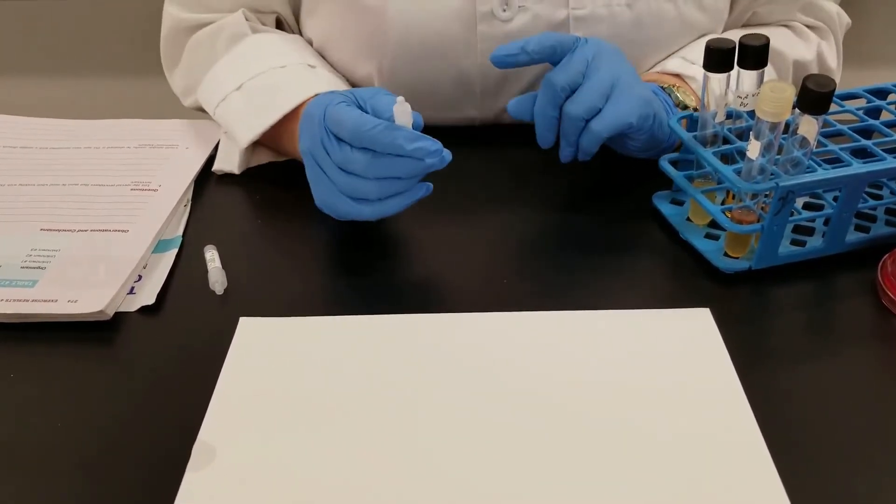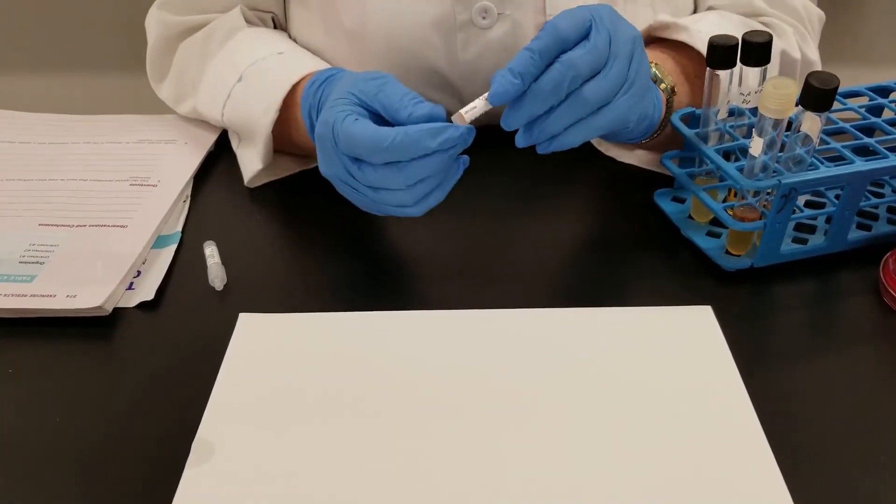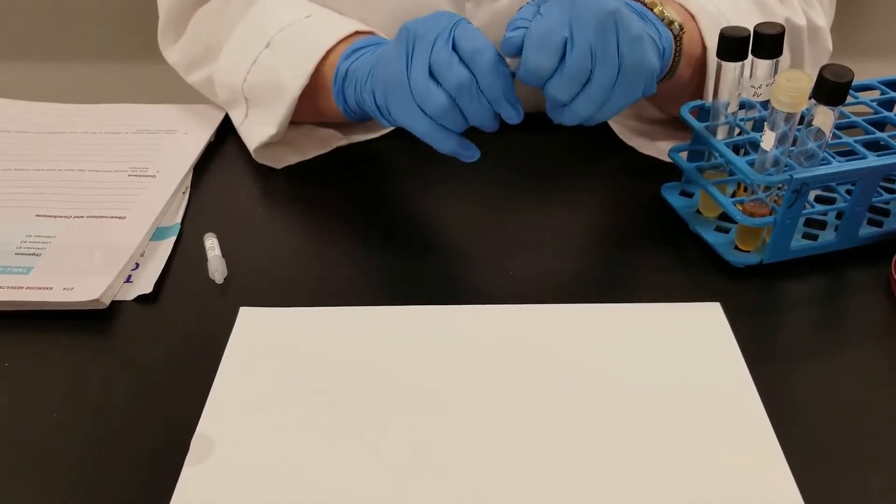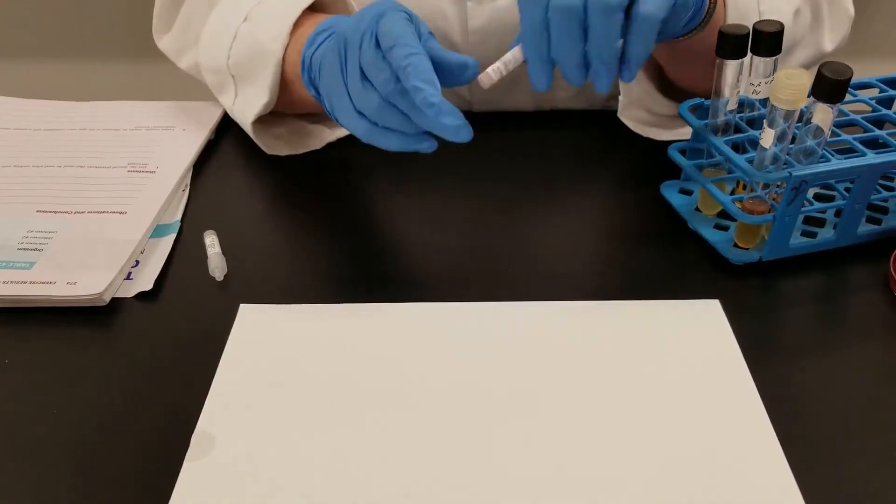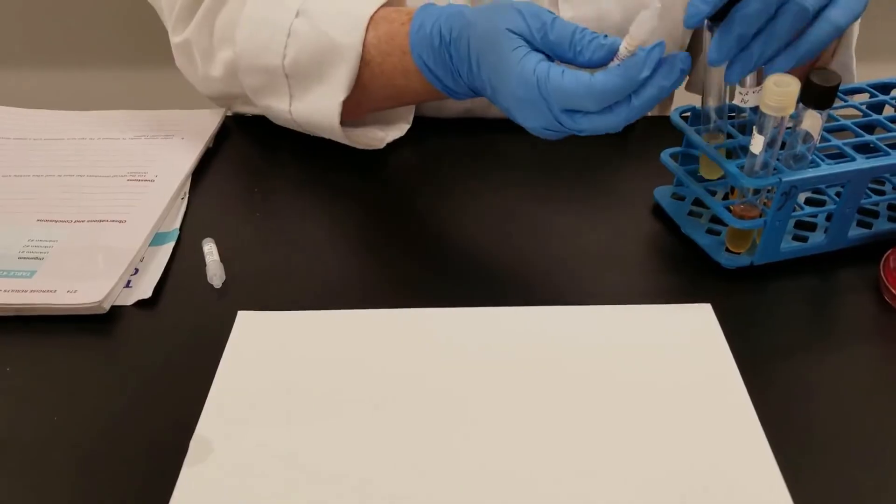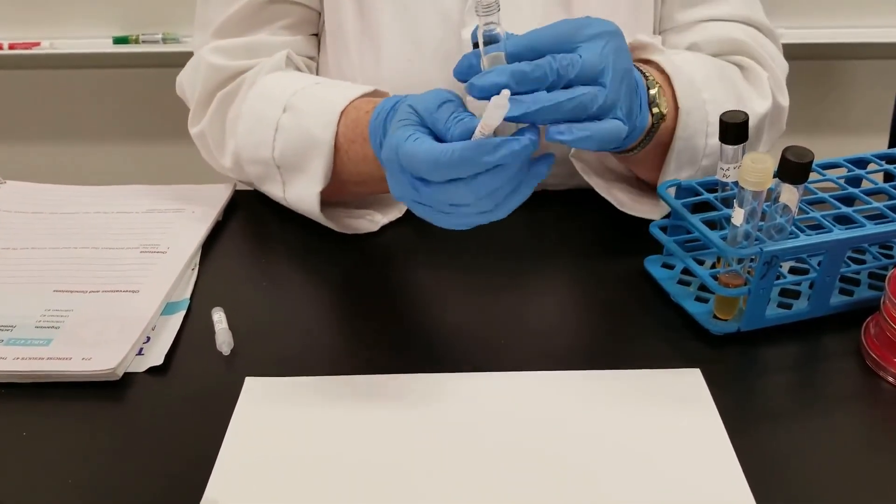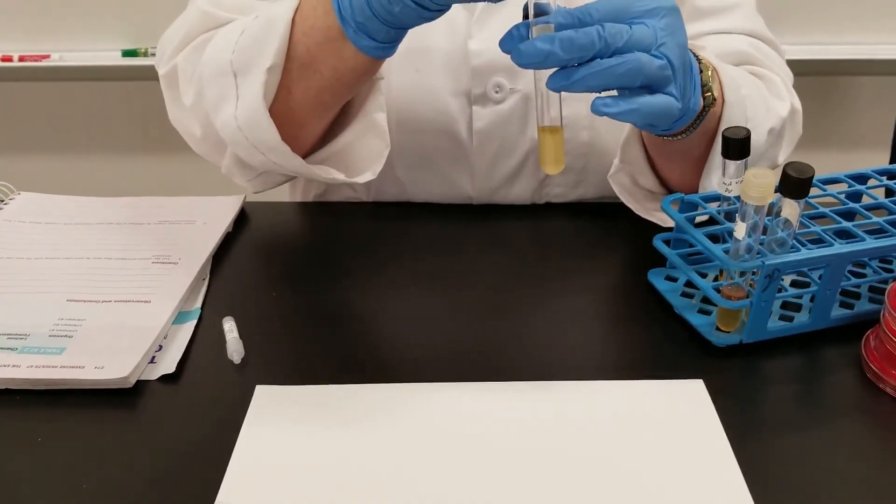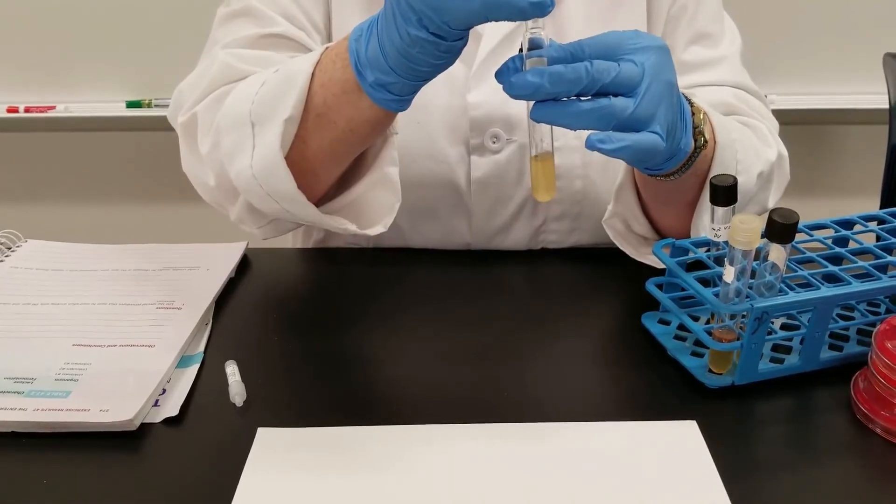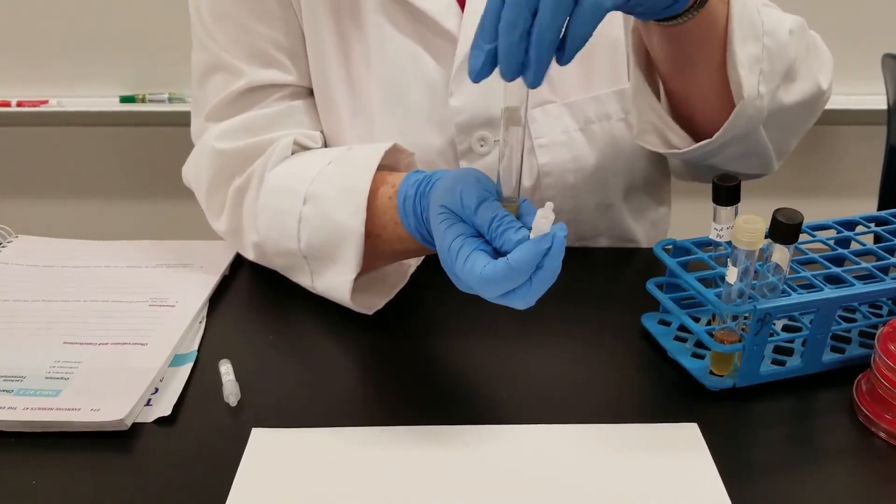For this one we are going to add reagents - there are two different reagents, an A and a B. With these there is a little glass tube in here. If you just push it you can hear that it breaks, and then you will add about ten drops by squeezing the tube. That is the A. I am going to go ahead - this is Enterobacter aerogenes.